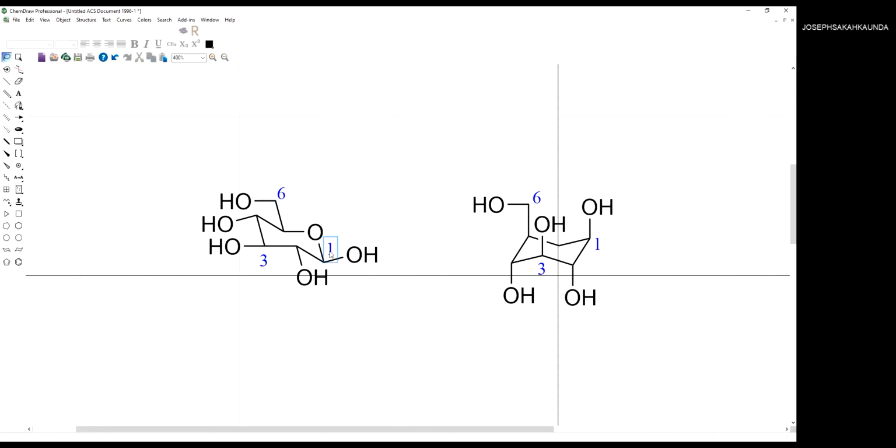Then if you follow proton, COSY, you can get this one. Sometimes you get this one too. Sometimes due to overlapping signals, you rarely see these two. But if you're struggling between this and this, which one belongs to carbon 3, which one belongs to carbon 5, then you can also check HMBC.